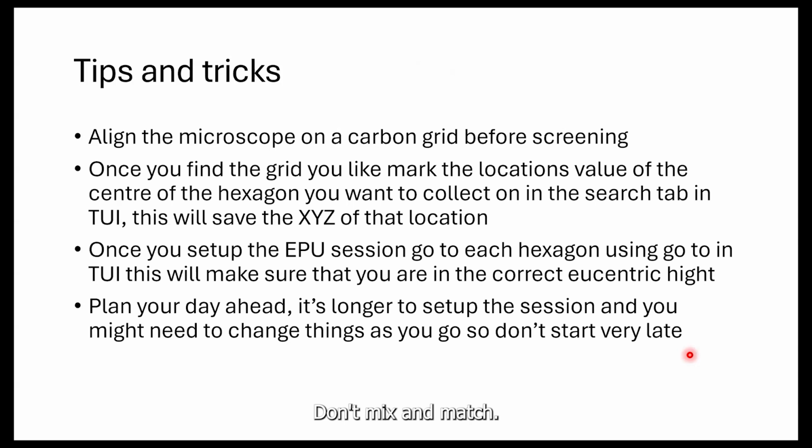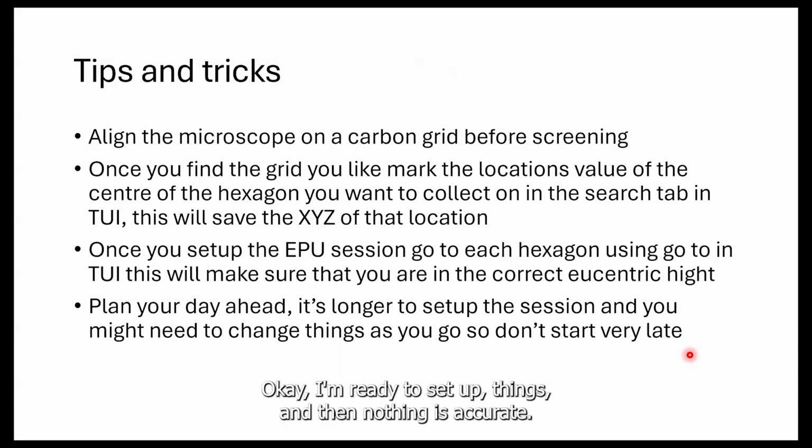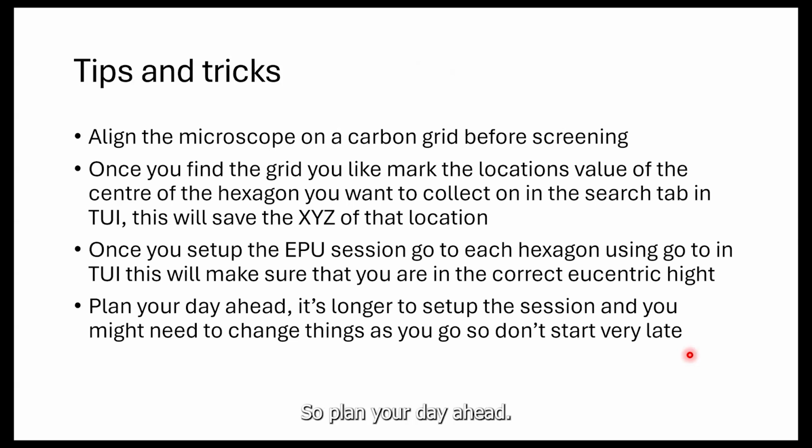Don't mix and match, plan your day. Don't atlas the grids and disappear because you have some lab things to do, you have some meetings to attend, and then you come back at 3 p.m. and, okay, I'm ready to set up things, and then nothing is accurate, nothing is working. Some facilities will not be there to help you because some facilities leave at a certain hour. Some facilities will stay, but will not be happy about it. So plan your day ahead.